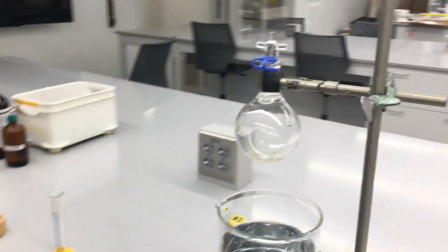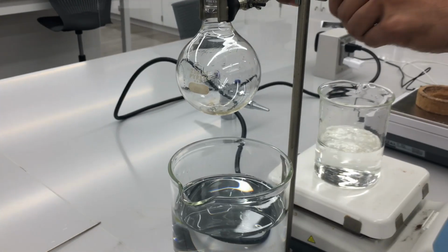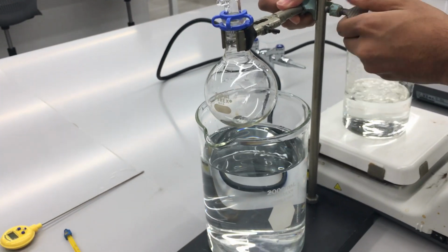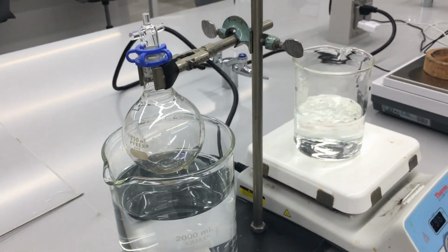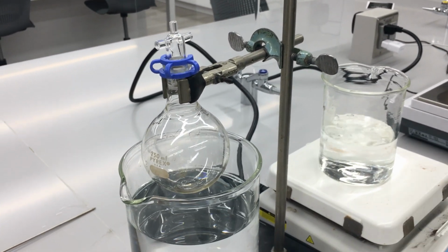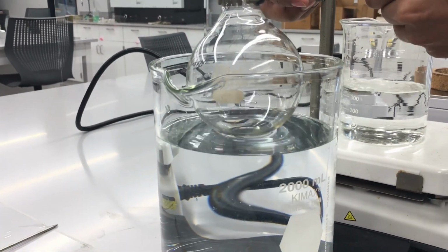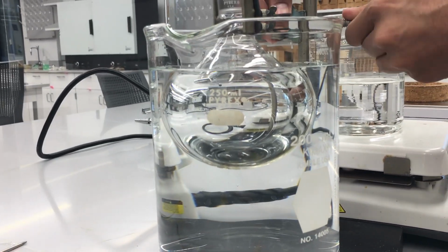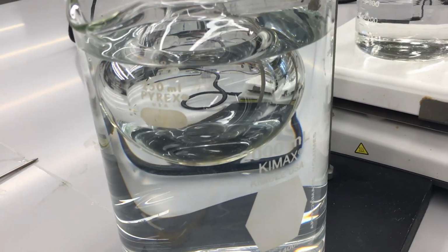All right, so now that pretty much all of the volatile compound is vaporized, we should go ahead and check our temperature measurement of our water bath, which will also be the temperature of our volatile compound. See that it's very close to 100 degrees Celsius. And we can go ahead and condense down our gas. So we'll go ahead and pop it into our cold water bath.